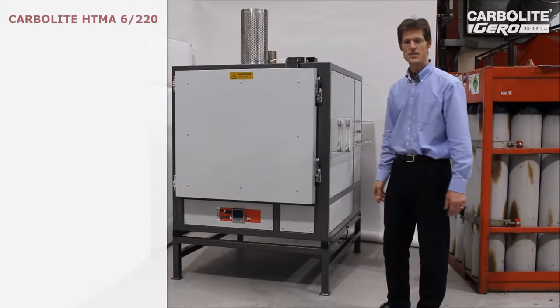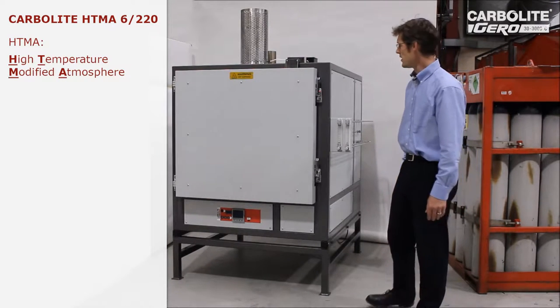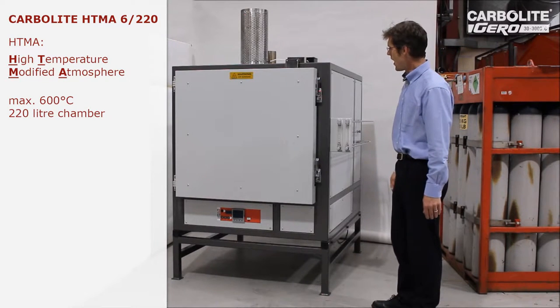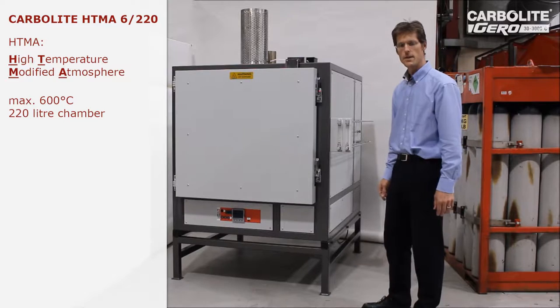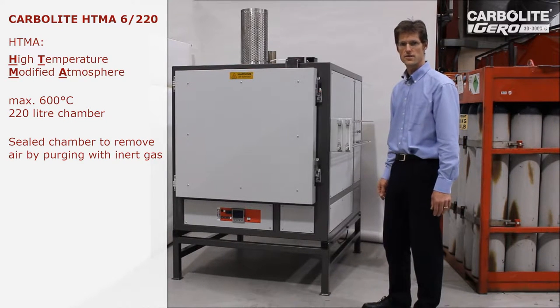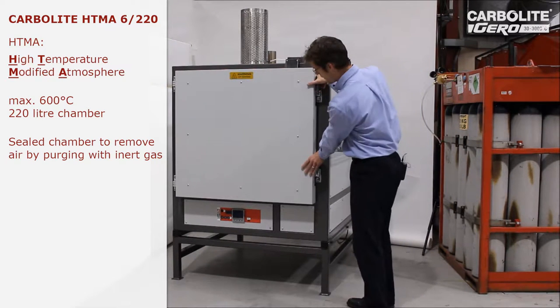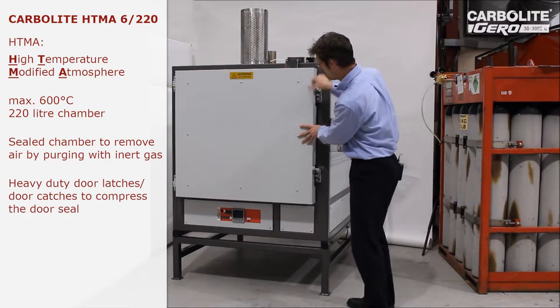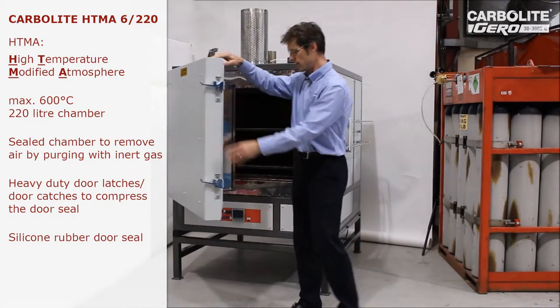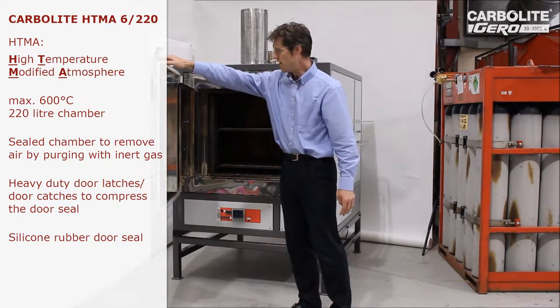This oven is our HTMA-6220 — a high temperature modified atmosphere oven at 600 degrees C max and 220 litres. Modified atmosphere means the chamber is completely sealed so we can pass an inert gas into the chamber, excluding air. Part of that is that the door has heavy duty catches and a silicone seal, which compress the seal to keep the air out.